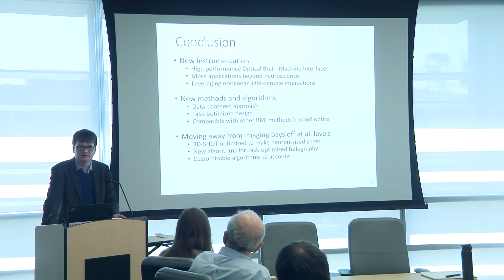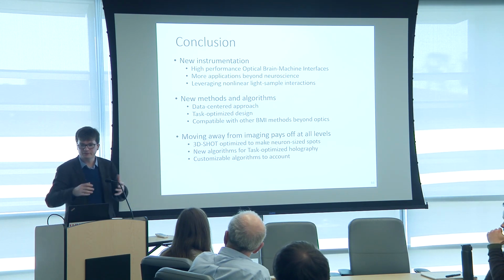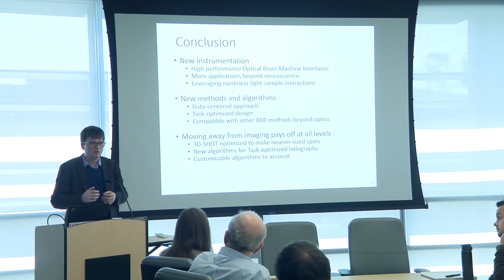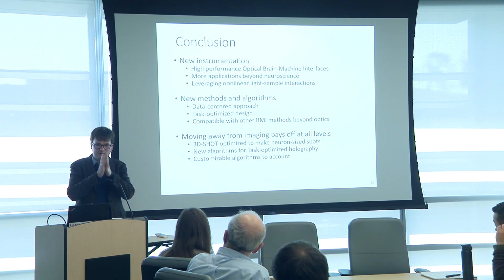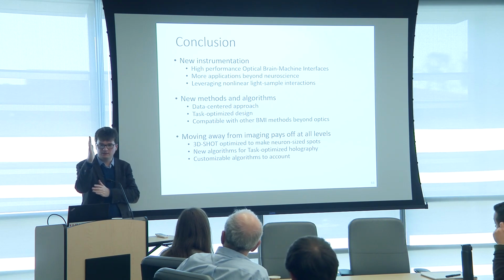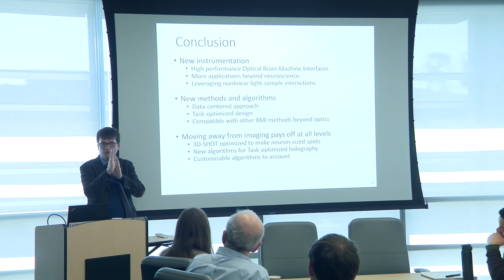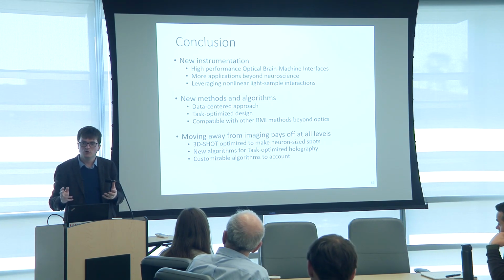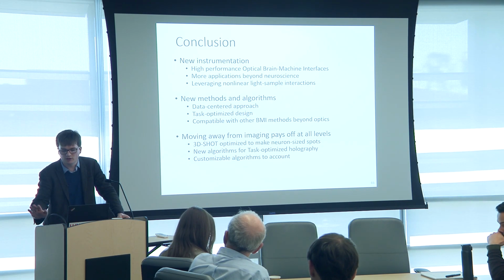The other thing that we suspect is because we're doing temporal focusing and literally building a pulse compressor, the diffraction grating and the lens is a pulse compressor. When pulse compression is a little bit off, you have a defocus between the plane where you recreate all the beams merging together and the plane where all the pulses interfere constructively. So you might be off by a micron or two up and down. You can geometrically compensate for that. We didn't notice anything worth fixing in the point spread function. But that would be one of the rare cases where pulse compression might actually not be so much of an issue.